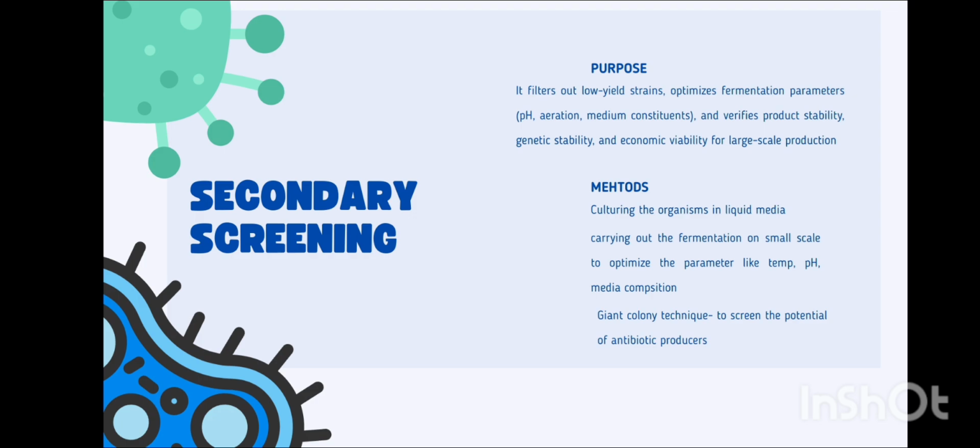Another method is the giant colony technique. This technique is used to detect the antibiotic produced by the organism. In this technique, the organism isolated by the crowded plate technique is further screened to detect the true potential of the antibiotic. The organism isolated during the primary screening is tested against the test organism. By testing against the test organism, the true potential of the antibiotic producing organism isolated by the crowded plate technique can be verified.